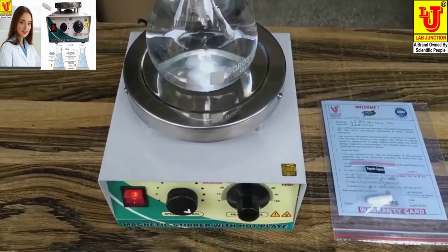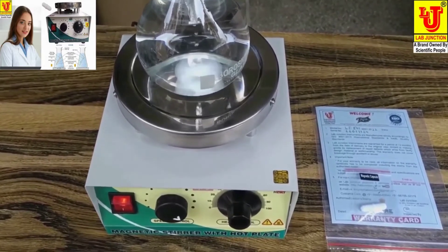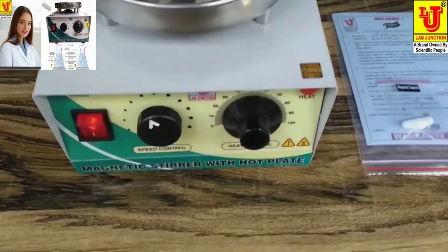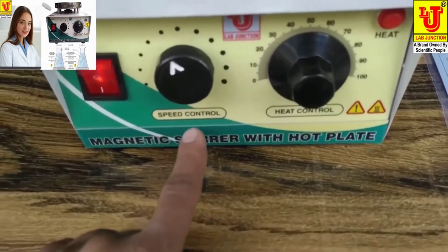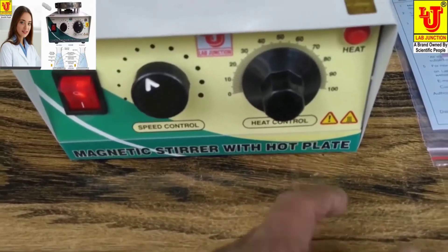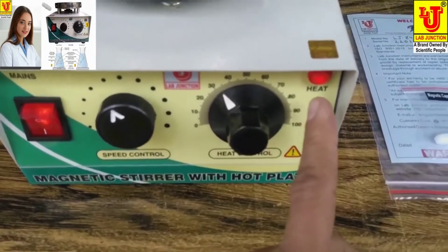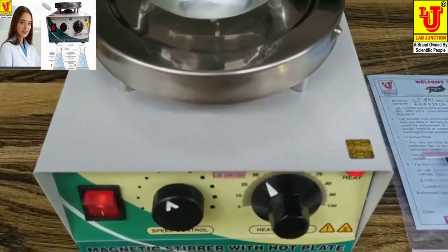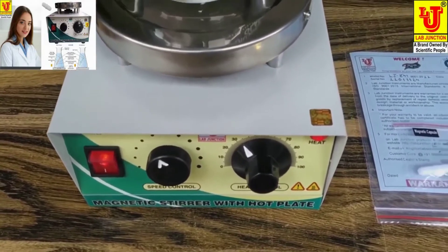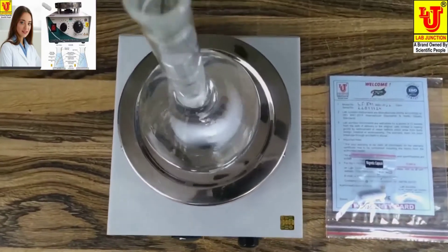LAB JUNCTION MAGNETIC STIRRER WITH SPEED CONTROLLER AND HOTPLATE LJ-841 AS PER QUALITY STANDARDS.